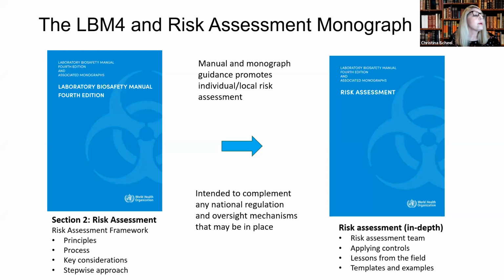So the Laboratory Biosafety Manual describes the essential risk assessment framework, including the principles and processes of risk assessment. And I may be saying RA frequently, which will be risk assessment, because it gets very tongue twisting after a while.